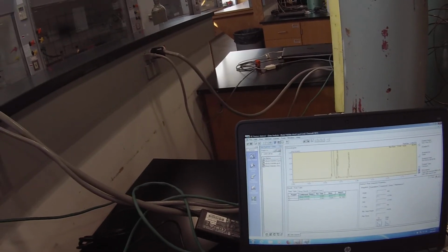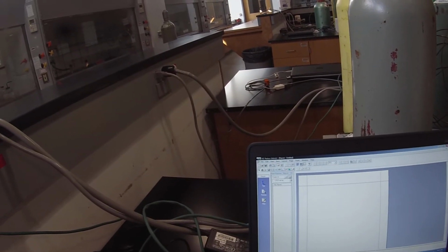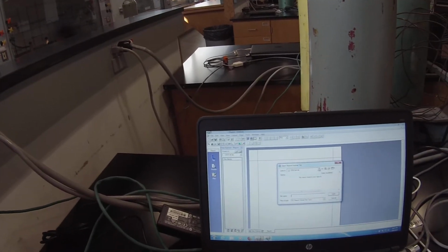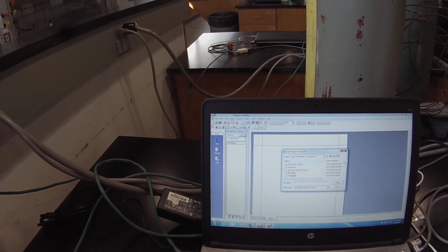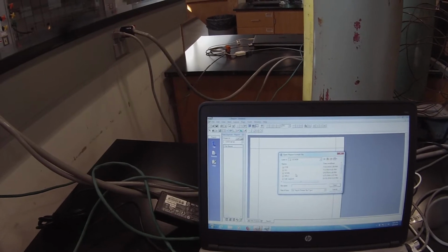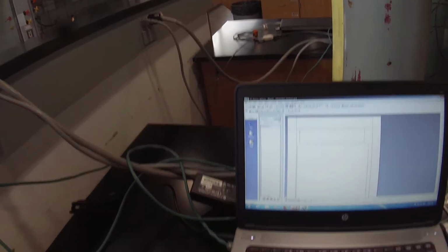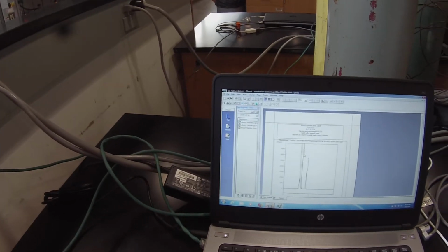And go to the top menu. And I can open up my report generator. And that format file I saved into the OChem folder under J. OChem GC, report forms, substitution reactions, and then going back to the data tab here, I can pull that data file in.